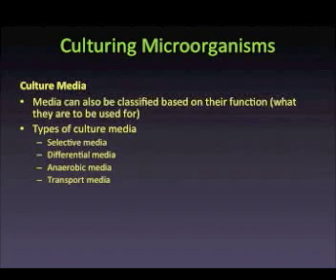Media may also be classified based on their function. Please be aware as we move into this section that one medium may have multiple functions, and that these same media are also classified based on the properties that we have already discussed. To provide an example, one can grow two organisms on a solid, enriched medium that would allow selection and differentiation of these microorganisms. The types of culture media that we will explore based on functional titles are the selective media, differential media, anaerobic media, and transport media.